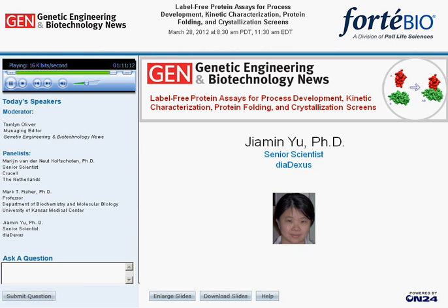All right, we have a listener wondering if this system functions just for aggregate proteins. I think the goal was to actually screen out the protein constructs that will generate aggregate protein so that you can continue to work with constructs that are expressing good quality protein. So it's not just, well, I guess it is to screen out the aggregate, but that's not the only function of the assay.